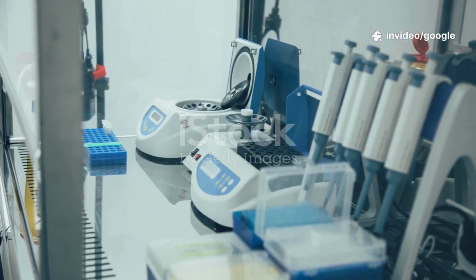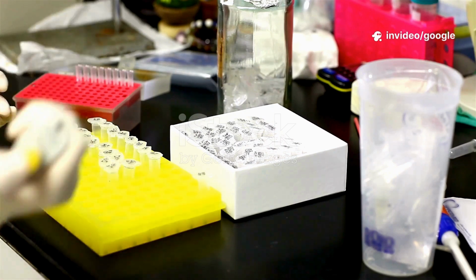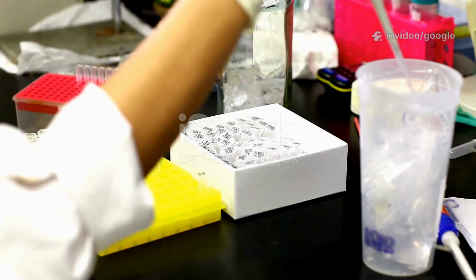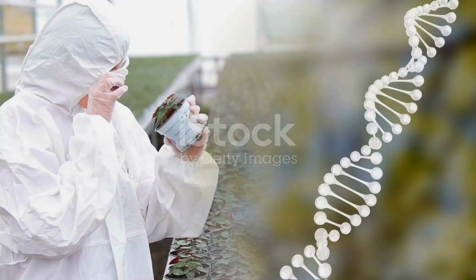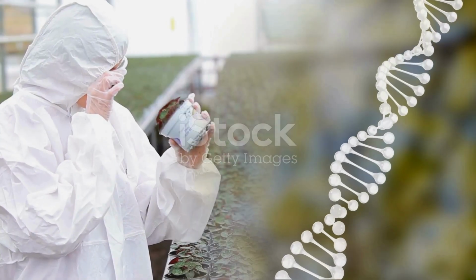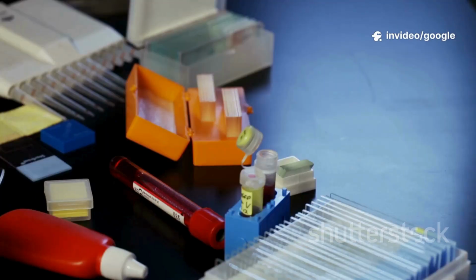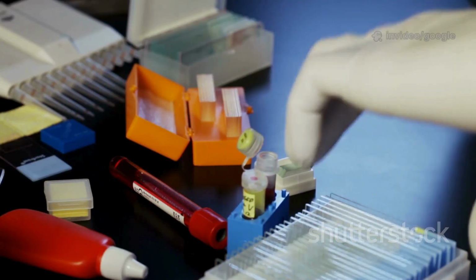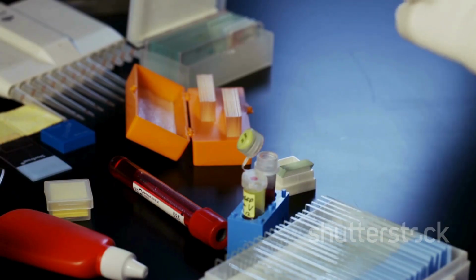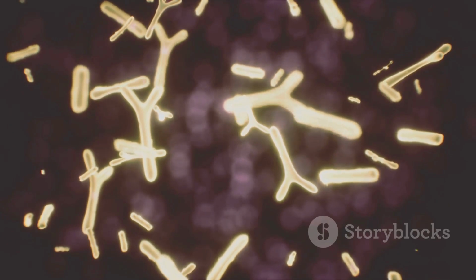2. Obtaining the Cas9 nuclease, recombinant Cas9 protein. The most common approach for RNP complex formation is to use purified recombinant Cas9 protein. This protein can be obtained commercially or expressed and purified in-house, for example from E. coli. Cas9-encoding plasmids or mRNA. For some applications, Cas9 can be delivered as DNA in a plasmid or mRNA, which the cell then transcribes and translates into the Cas9 protein.